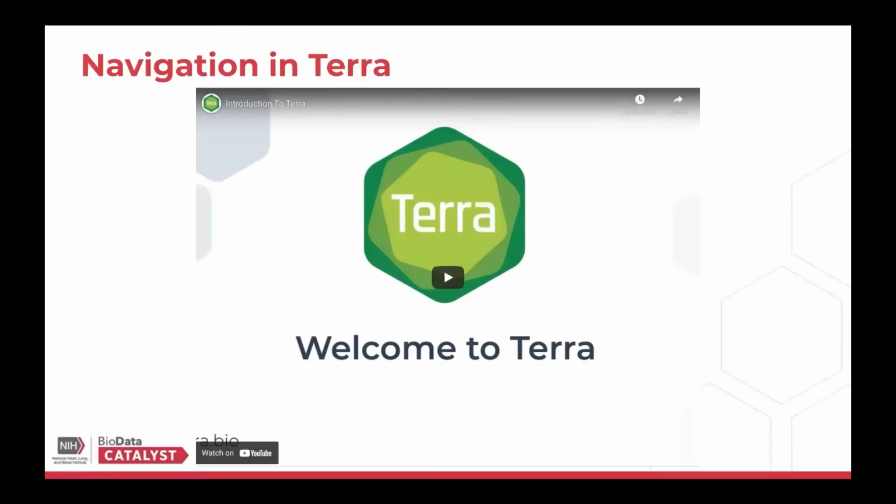All right. To start us off, I'd like to play a quick 3-minute video that goes through the high-level navigation in Terra.